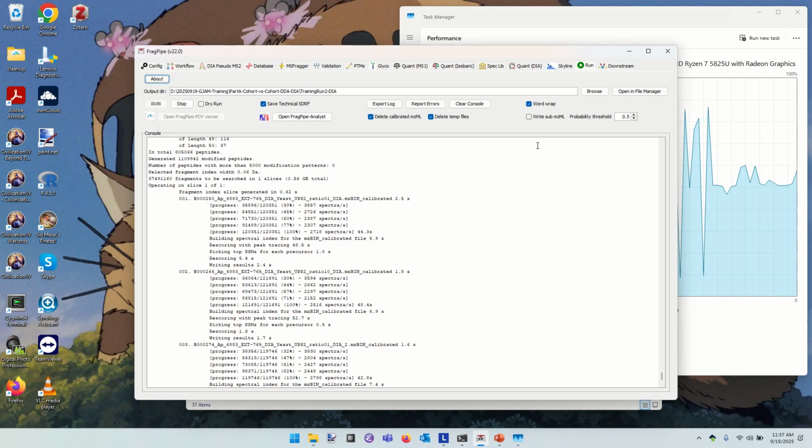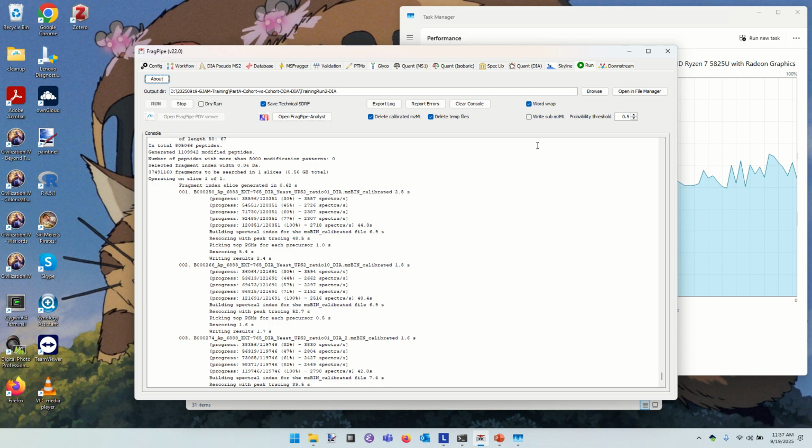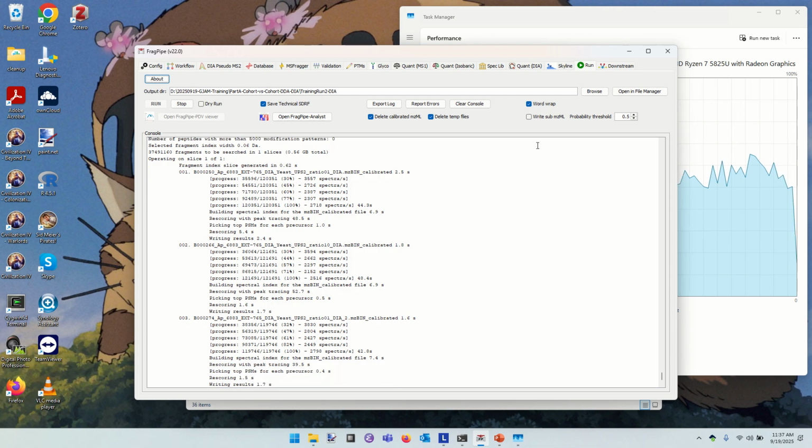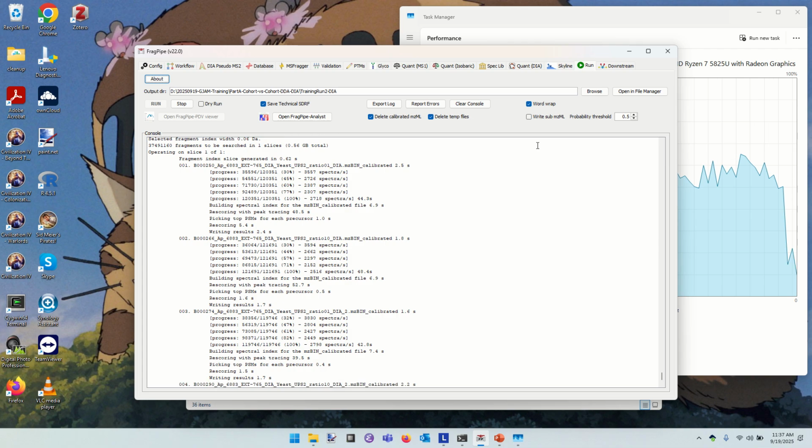DIA, by doing multiplexing, each MS representing multiple peptides, because it's multiplexing the evidence for different peptides into MS scans and acquiring more MS scans, covering far more of the available space, you can get a deeper proteome from a DIA experiment in the same instrument time that a DDA experiment takes. So that was a big surprise for me.